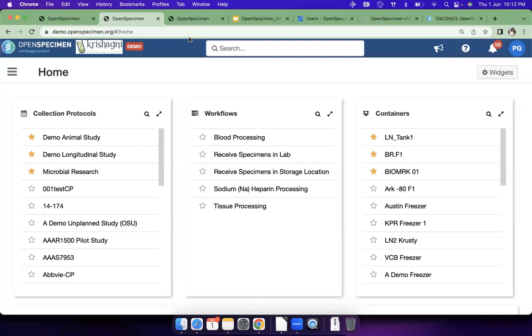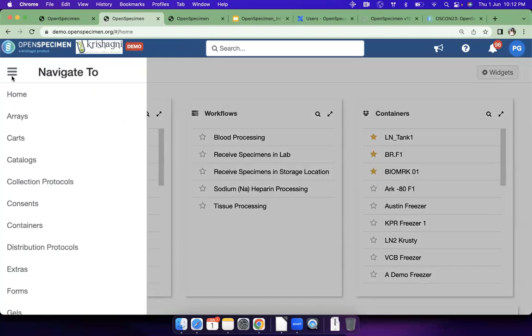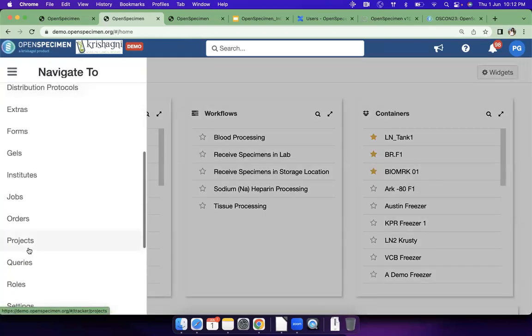On the screen, it showed the 4 that I created were green. The one I didn't was yellow. Is there a way to remove that one? Yeah, so it just shows it. There is a setting to hide the pending ones after a few days or even immediately after collection. This is just to show you that out of 5, you collected 4, but you can hide the pending ones. There is a setting to hide them.